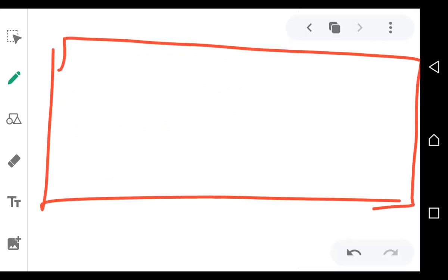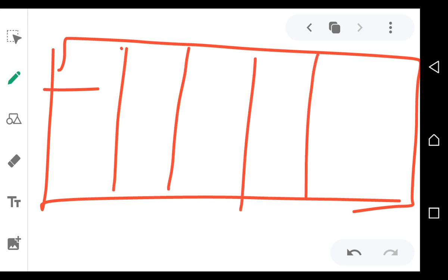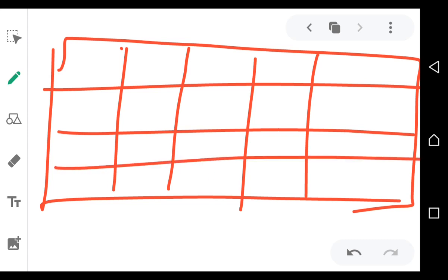So when you're labeling that table, it's going to be like that. It's up to you. You choose the number of titrations you want. Sometimes initial is down and final is on top. Final volume, it's up to you who chooses. And then here it's used volume. Used means subtracting the final minus the initial.